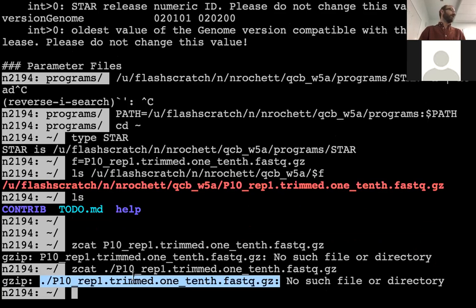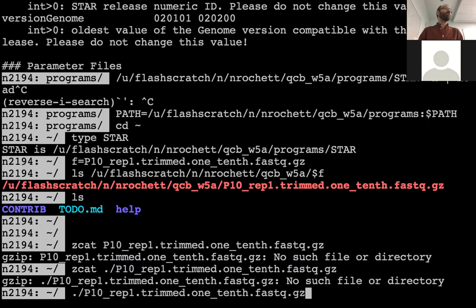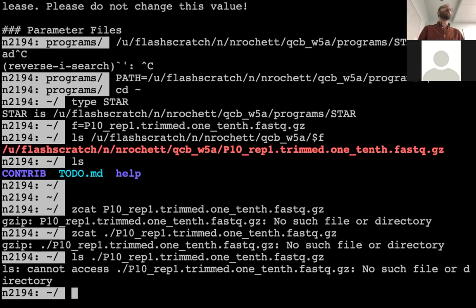And whenever you see this type of error, and usually it's going to be within a full command of a bioinformatic program and everything, something else might have gone wrong, and you can't be sure what's going on exactly. When you see this type of error, the first thing you want to do is go to the directory you think the program is running from. So in this case, I'm just in my home directory, and then remove the colon if there is one, and then just use ls on the file. And ls is not going to lie to you regarding which file exists and where.